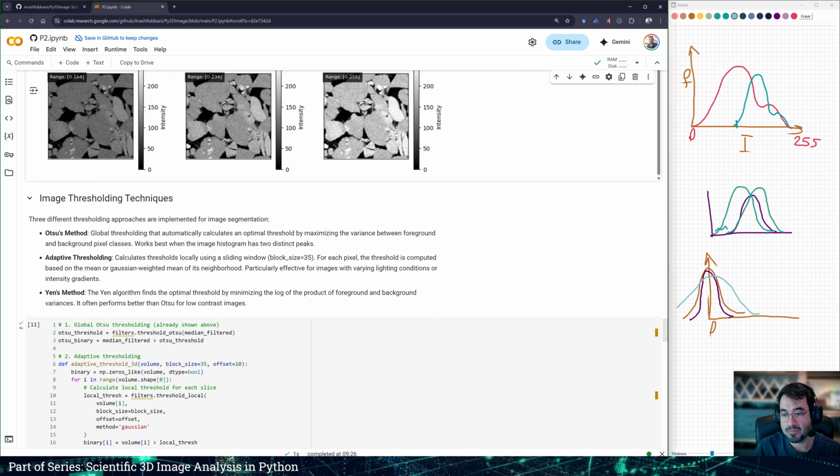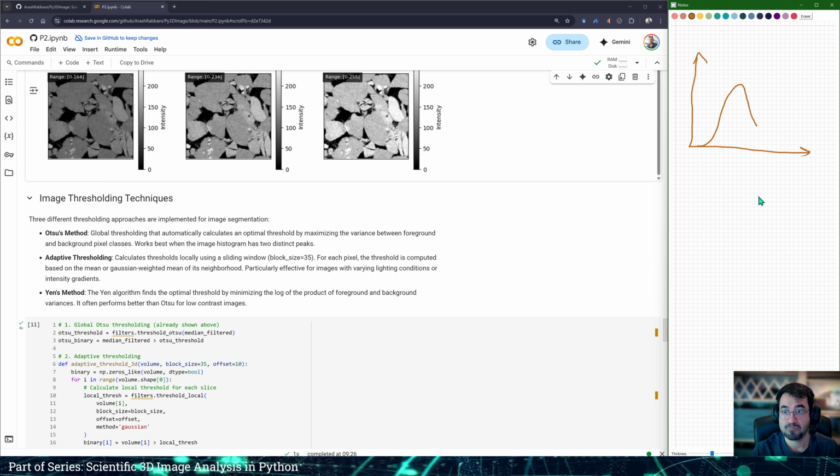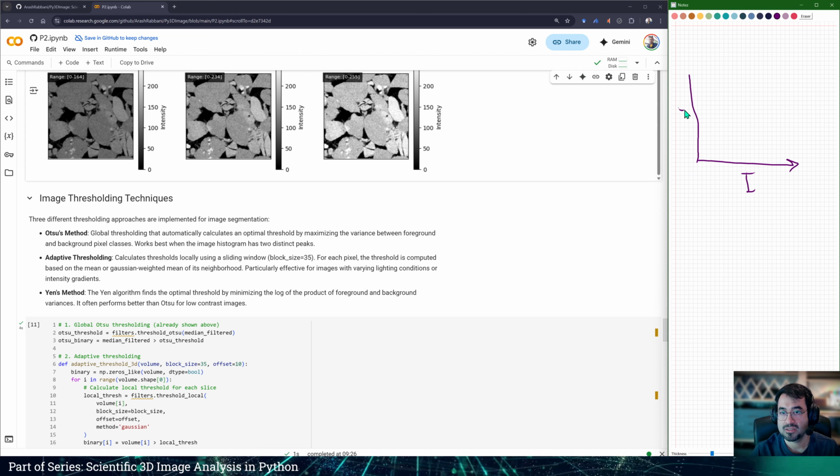If we look at it from a distribution point of view, because methods like the classic Otsu deal with it as a one-dimensional problem. Let me start again. We have the distributions, this is the intensity, and this is the frequency of them. Here, in this image, we have around 20% dark pixels, and the rest are gray and white. If I wanted to represent that, it's going to be a peak like this, and then a bigger peak like so to represent the lighter colors.